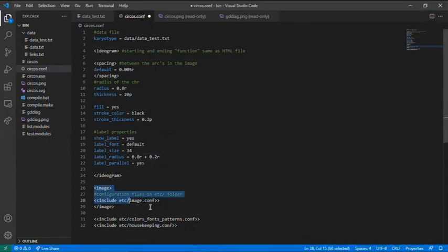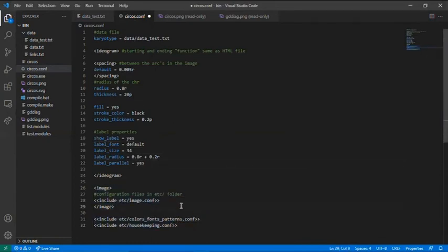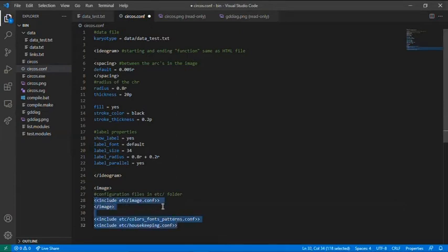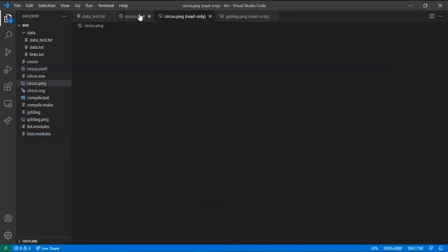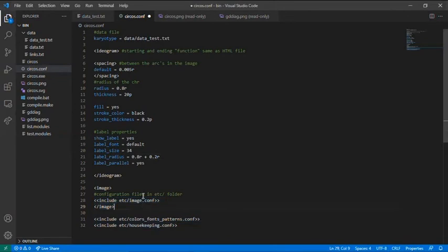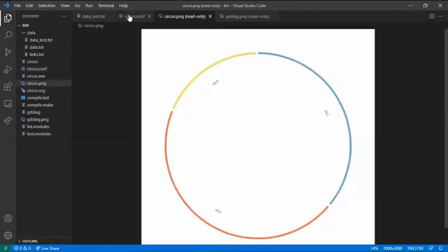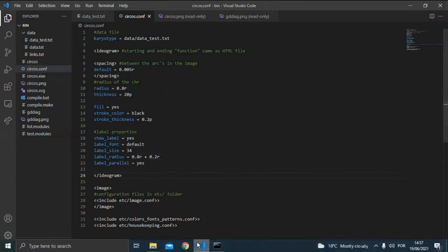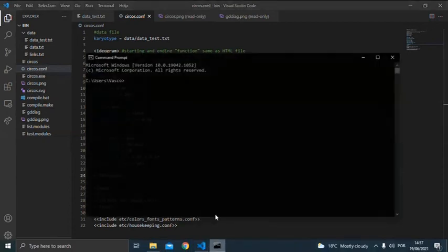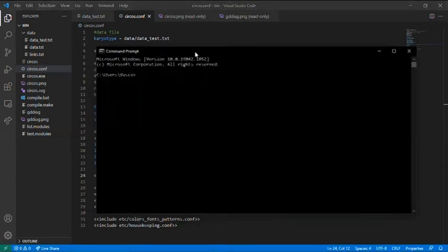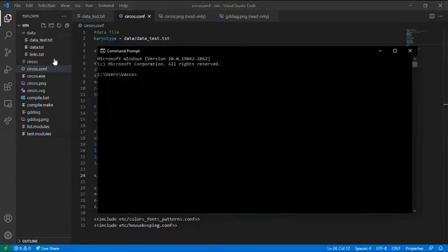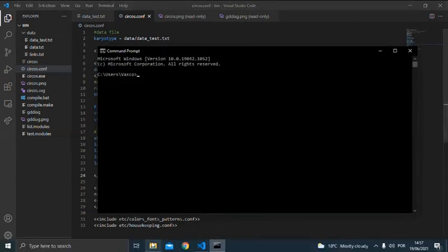And here are all the configuration files that come with Circos. Just copy the same and you will have no problems. Now save the file, but how do I plot this image? You need to come to the cmd and again, come to the bin folder.